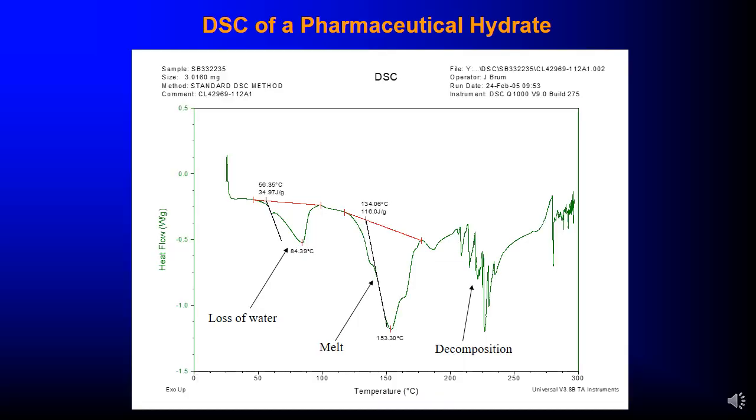And then differential scanning calorimetry of a pharmaceutical hydrate, you can see also loss of water. Then we have melt, then we have decomposition. You can see all that.